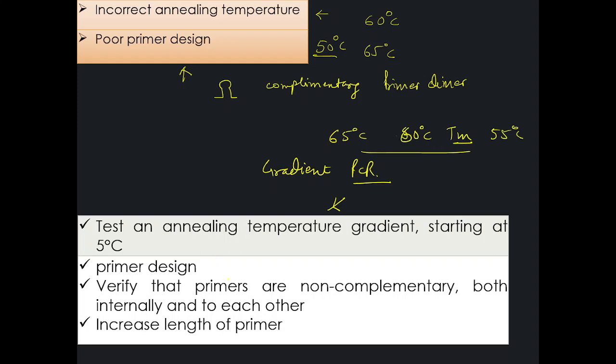For primer designing, there are several software programs available. You can use Gene Runner, which is a software we use often in our laboratories. You can also use Vector NTI, though it is commercially not available. You can also use the Clontech PCR software for this. You can also use the NEB PCR designing tool as well. There are other software like Eurofins, and I will share that link with you.